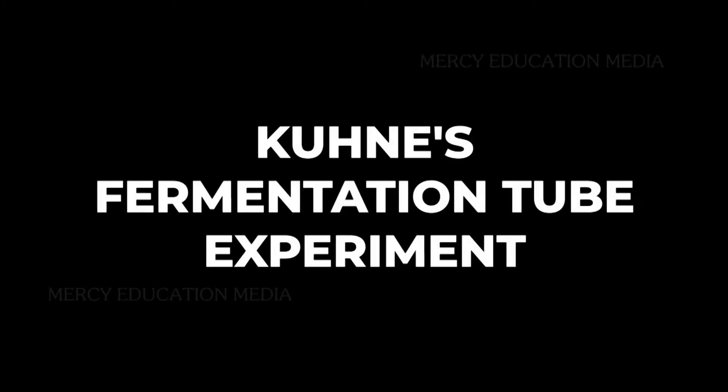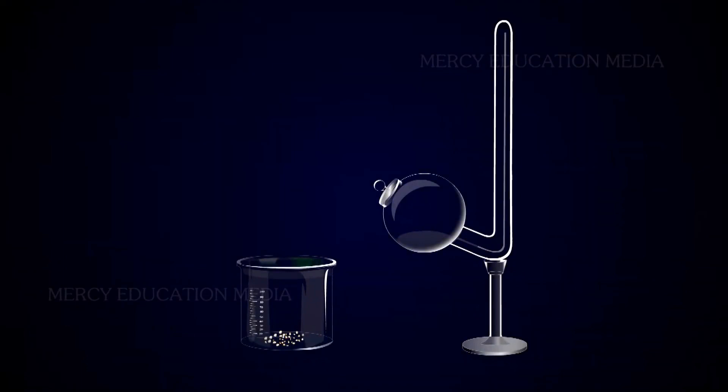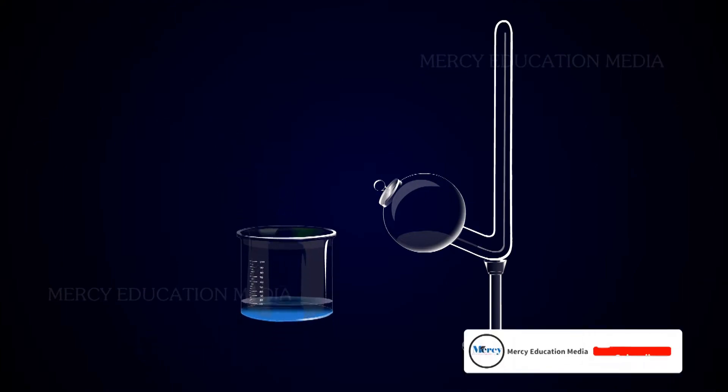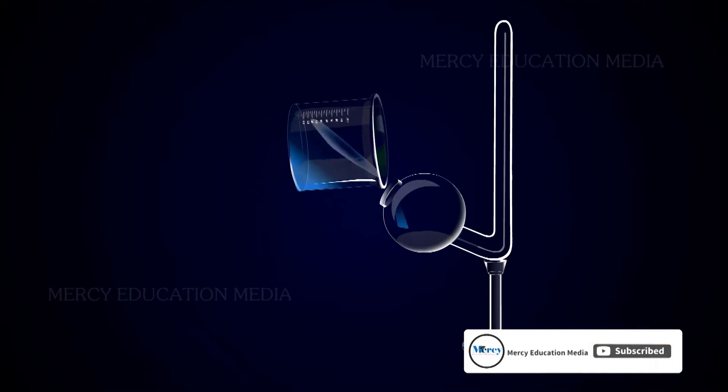Let us see Kune's fermentation tube experiment. Kune's fermentation tube consists of an upright glass tube and a side tube with a bulb. A 10% glucose solution mixed with baker's yeast is taken in Kune's tube, and the tube is completely filled.